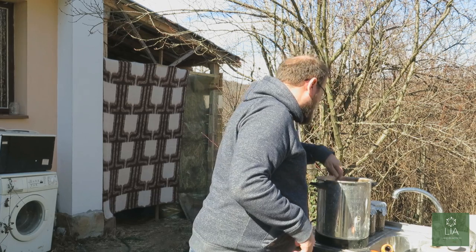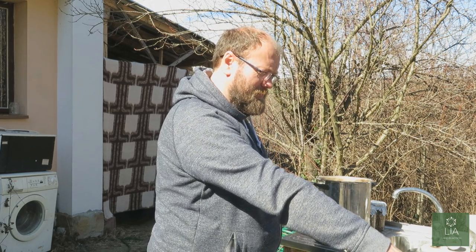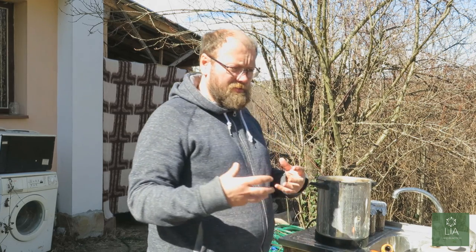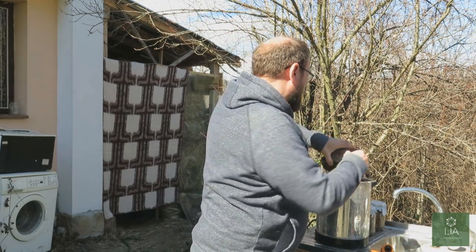Just pass me one of those. We just want to make sure that, because it's in the pressure cooker on its own, the jar doesn't bang around.